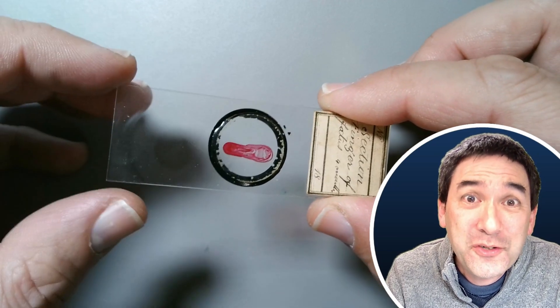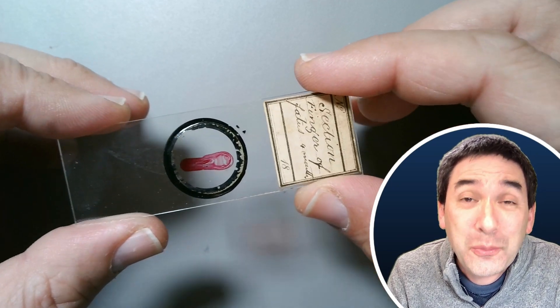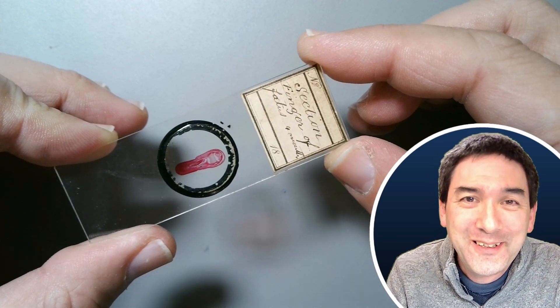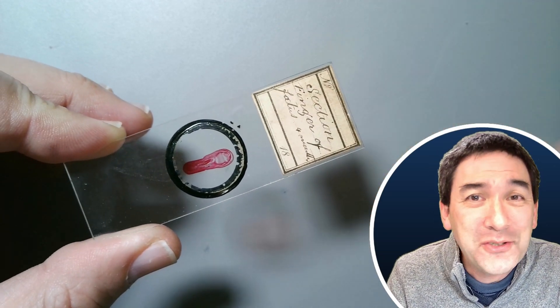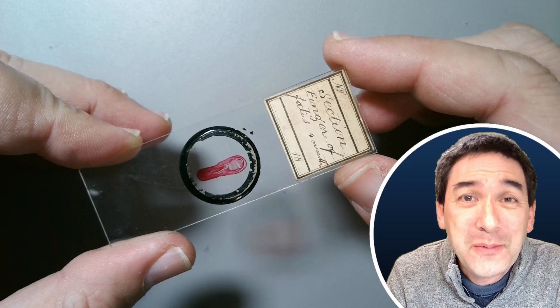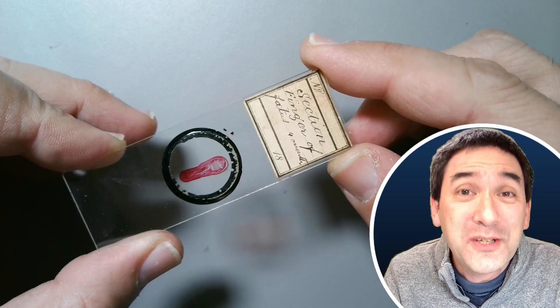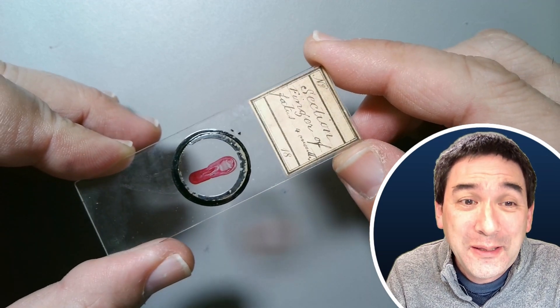I just want to say: if you yourself are making permanent microscope slides, please do put the complete information on it, including a date and maybe also the mounting medium used. Because who knows — maybe in 100 or 200 years, somebody is going to rediscover your slides and start to collect them.